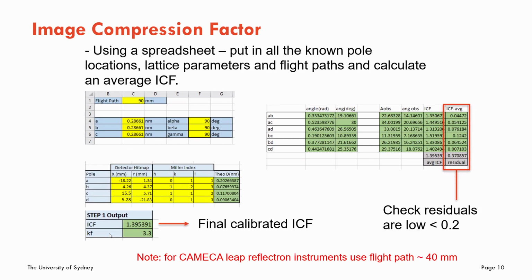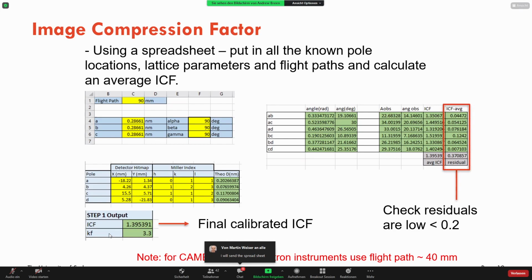So I haven't used this plane here, but for instance, the 001 direction. I probably should have had a little bit of a diagram here, but if you imagine that in BCC or FCC, you've actually got that central plane in the unit cell. So you'd be entering 002 to just account for that plane spacing. That becomes important when you go through and try and calculate the field factor.